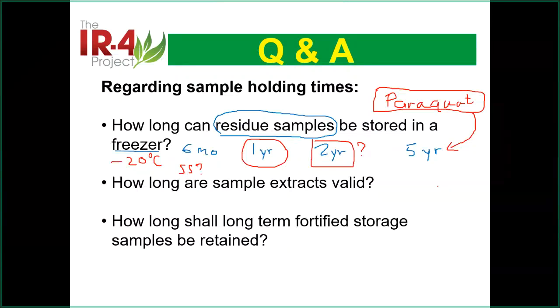If it is an extreme case like this, 5 years or longer, no problem, because it's a salt. It dissolves in water. If you use a plastic container and put it in the freezer, it will last longer than that. I did one study, recovery after 5 years was like 95, 98, 99. So no problem. And of course, your storage data is the key.